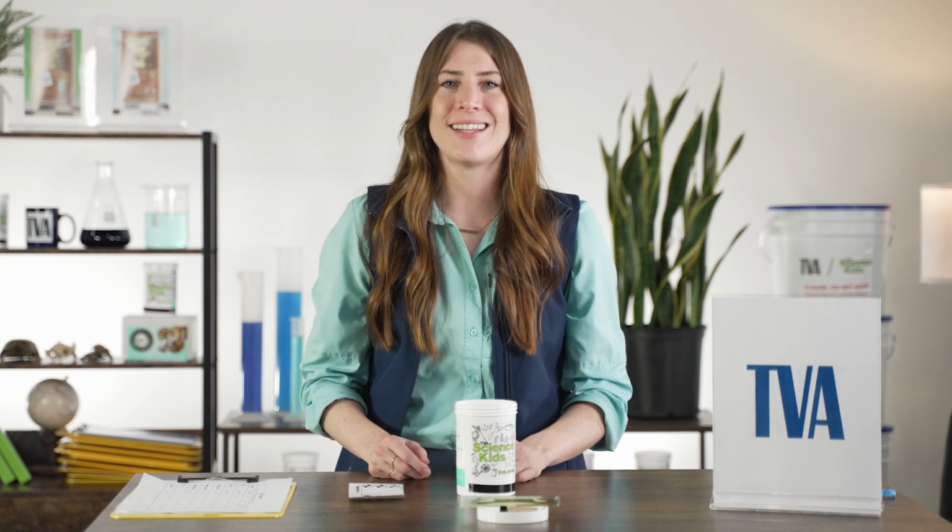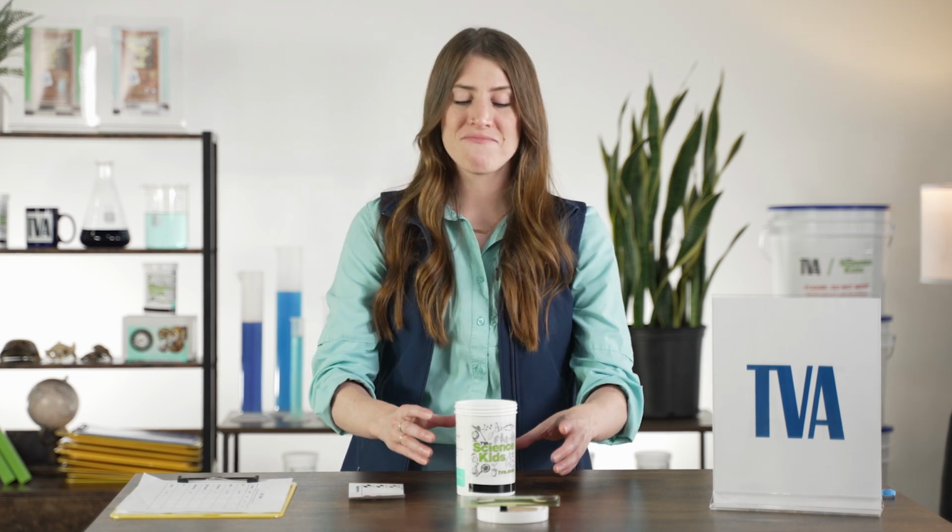This experiment, we're going to be testing our turbidity. That's a funny word, turbidity. You should try saying it out loud. It's fun to say. Turbidity. All right, that's pretty good.